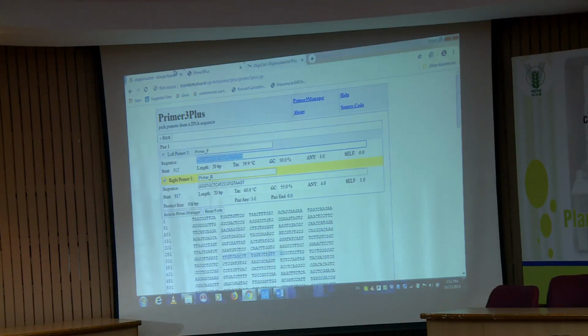So, from there you can have an idea that the primer can bind in other genomes, other organisms also. And one more thing, let us suppose you have some organism, the primer designing should maximum be from the conserved region. Conserved region means, because there is variability of 1, 2, 3, 4 bases among organisms, depending on how variable they are from each other.